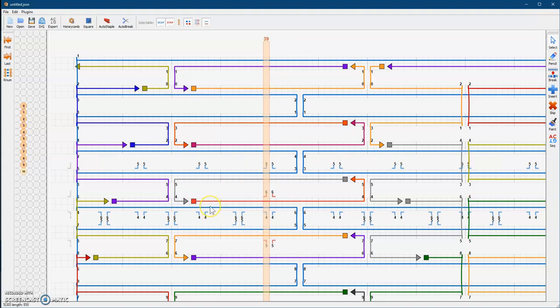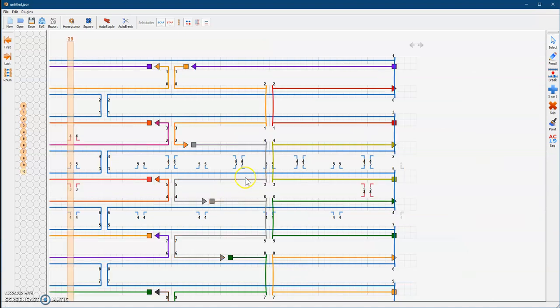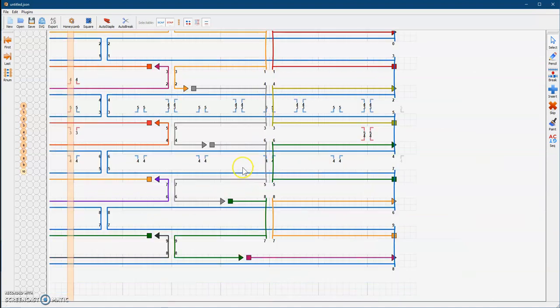If you look at the blue one, it says 850 — that's how many bases my whole scaffold strand is. But if I hover over this red one, there it is — a length of 32 bases, which is good. Everything looks good, and once all your highlighted strands are gone, you're ready to add a sequence.